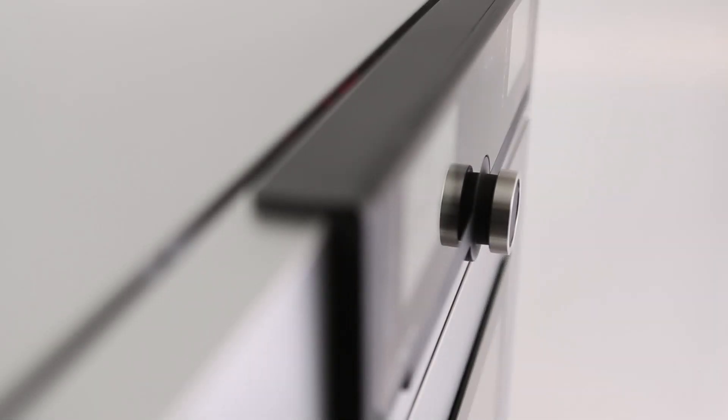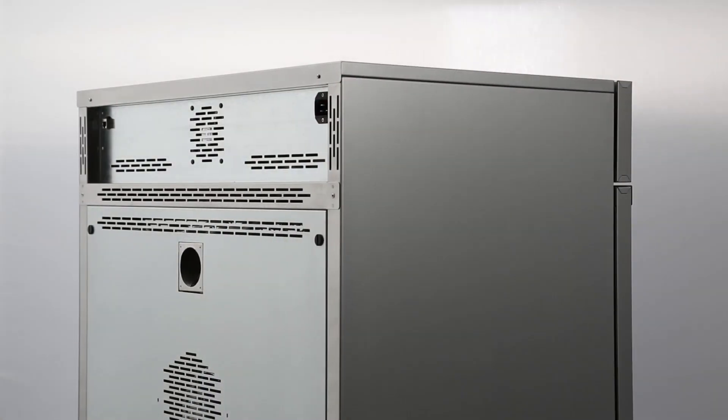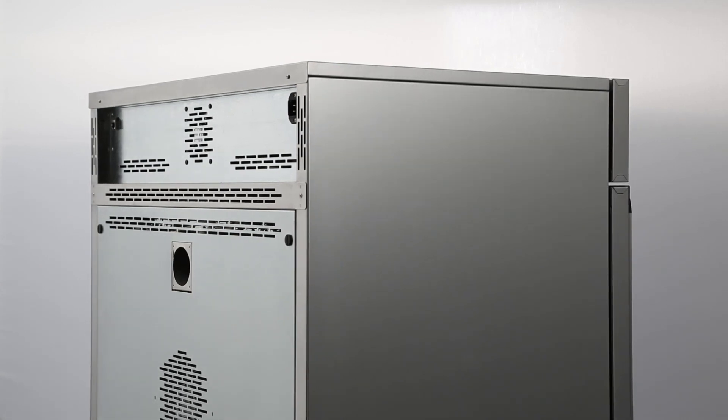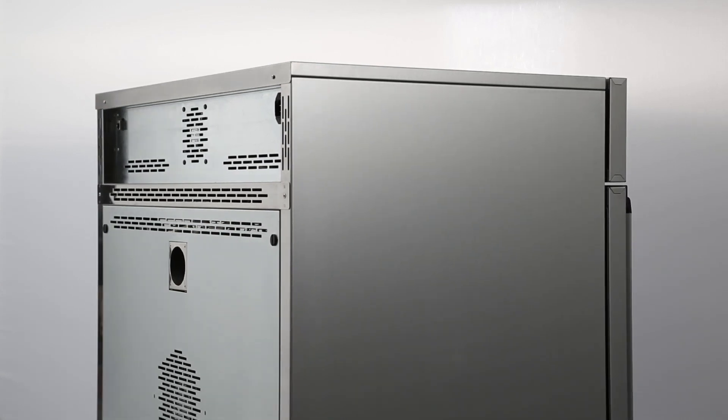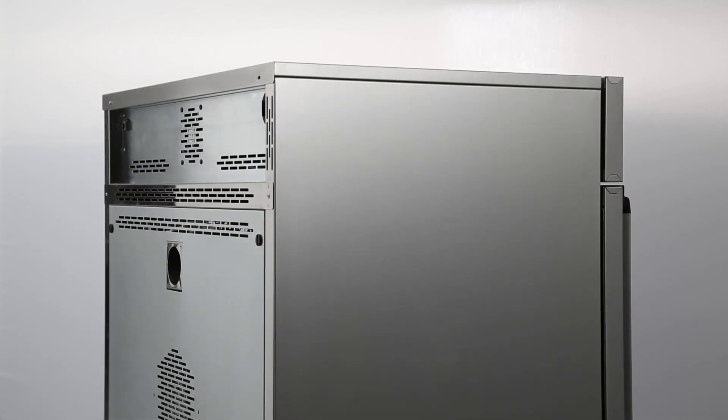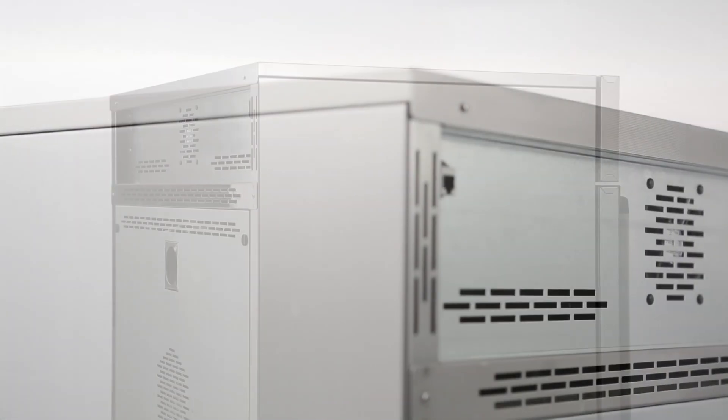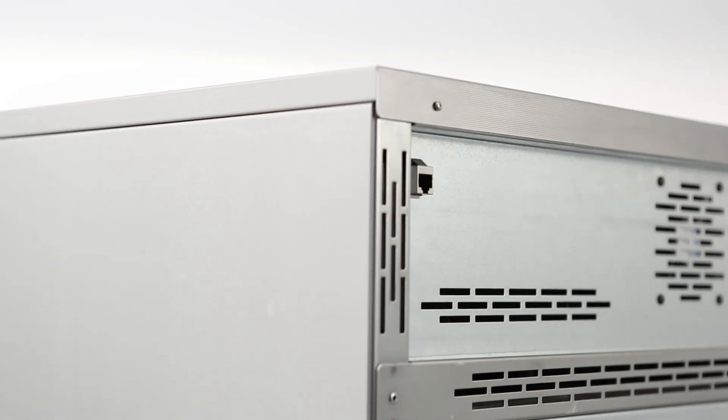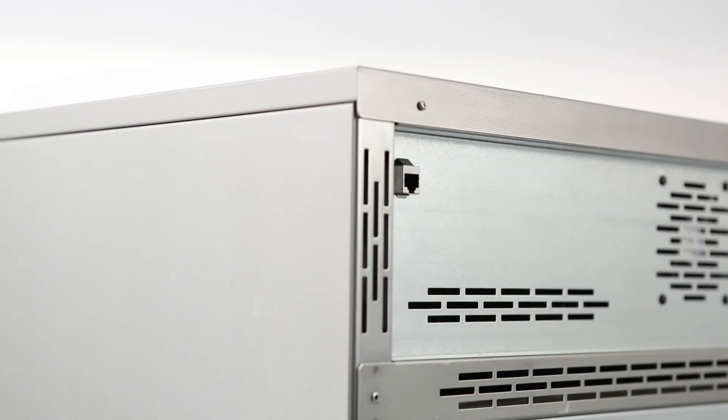We think that the programming of an oven should be possible from anywhere in the world without problems. For this reason, our generation 2012 appliances feature state-of-the-art communication interfaces.